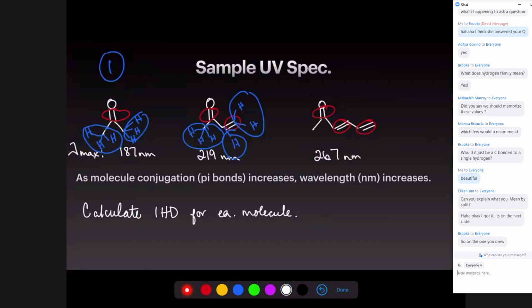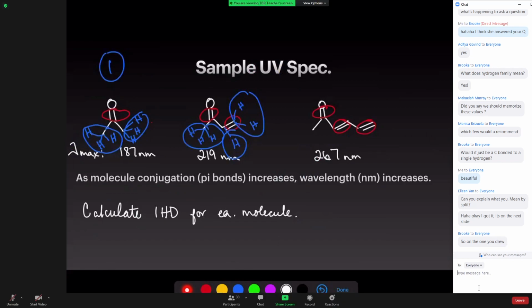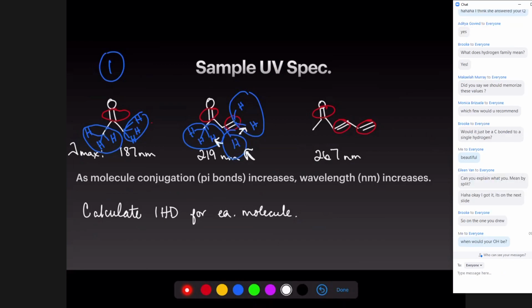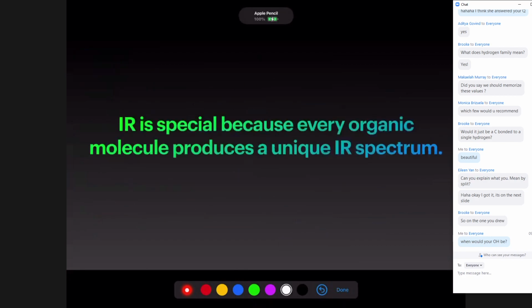So we're basically trying to understand the neighboring hydrogens. If we're looking at this hydrogen, these are what we are calling neighbors. If we're trying to evaluate the splitting pattern of this hydrogen specifically, then we're looking at those neighbors.